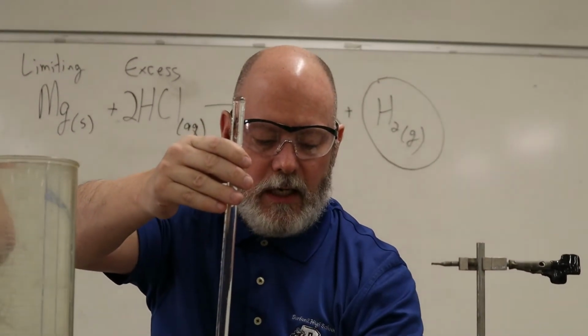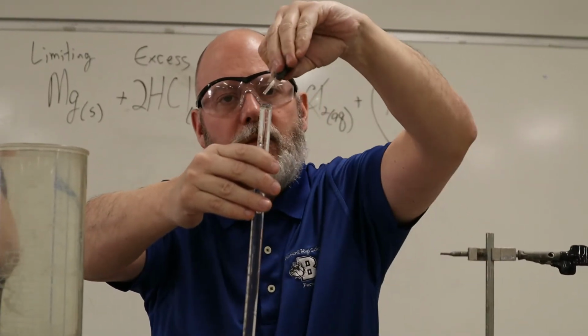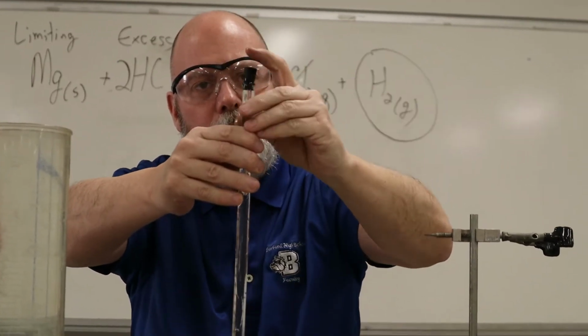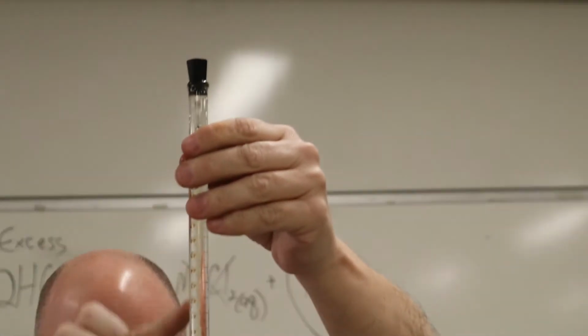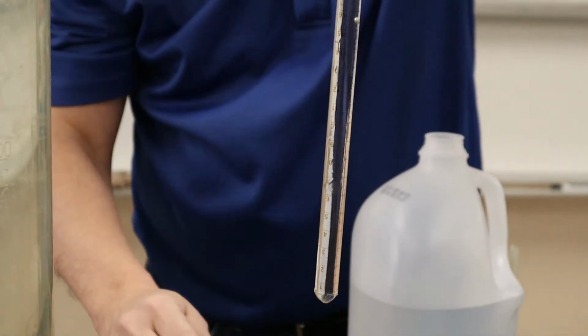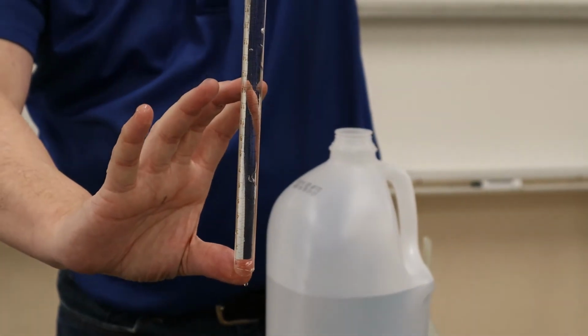So now I'm gonna take my thing here, I'm gonna stick it in, okay? Just like that. Push it down. Okay, and I don't see any air. I'm looking all through here. I don't see any air bubbles, okay? So that's good.